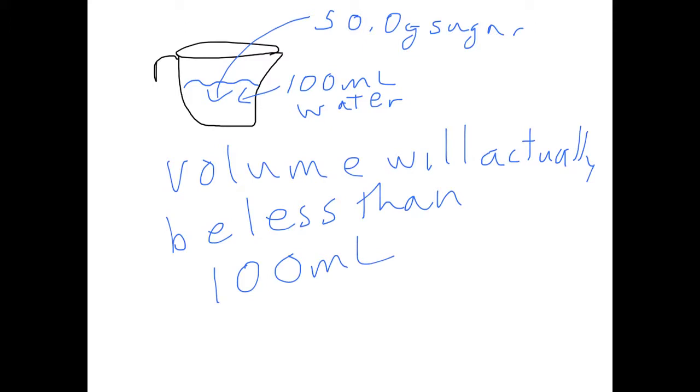The sugar and water molecules love each other so much that they pull each other closer together than the pure water molecules did to each other. I guess you could say water is the ultimate chemical bad boy when it comes to sugar. A lot of self-hatred going on. The water molecules don't want to associate with each other, but they really love some sugar, and therefore they want to get closer to the sugar than they did to each other. So you actually see the volume contract.